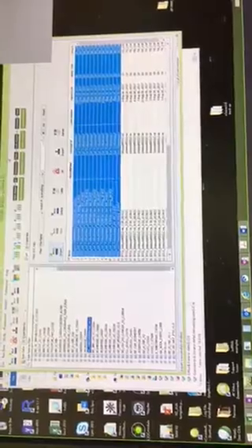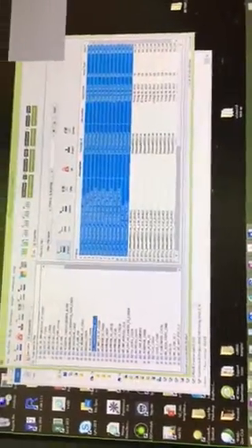A fair amount of information may not be in every spreadsheet export that you'll see. So I think it's really important to have the RCC files, and also if you'd like to do advanced analysis, which can be pretty powerful, you definitely need the RCC files for that. And in addition, you would need to import the RLF file.